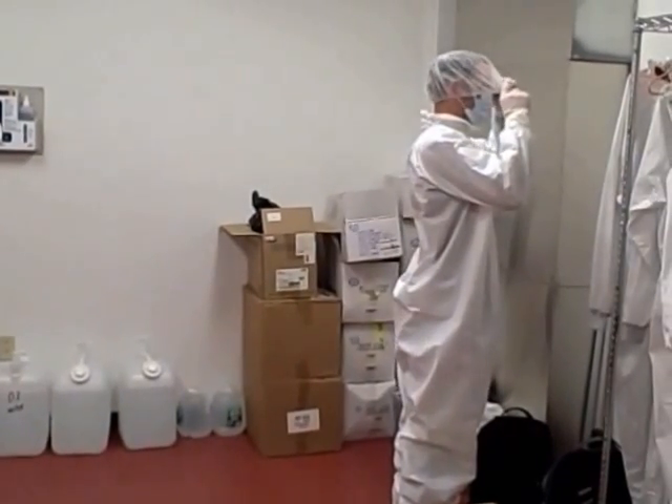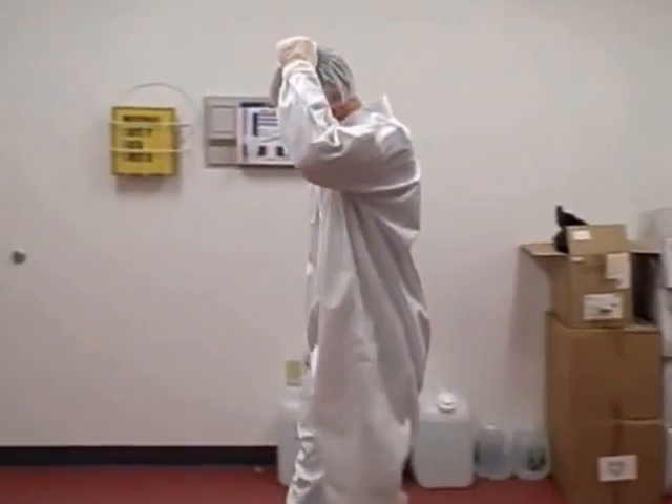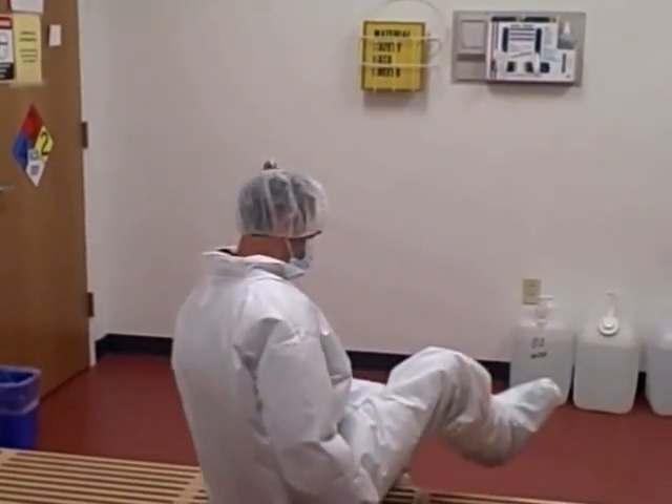To remove your clean room suit, start by taking off your glasses. Next, sit down on the bench and remove your overboots.